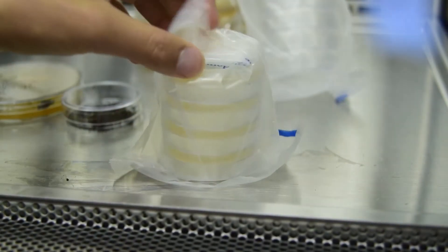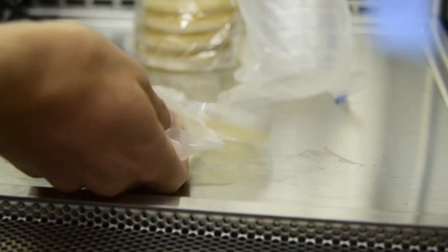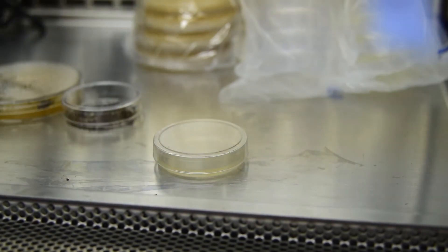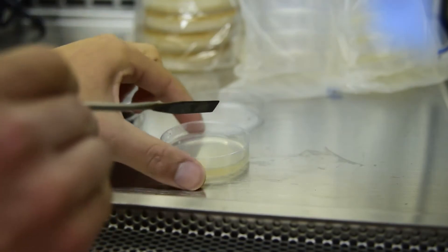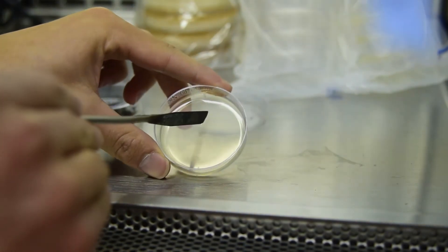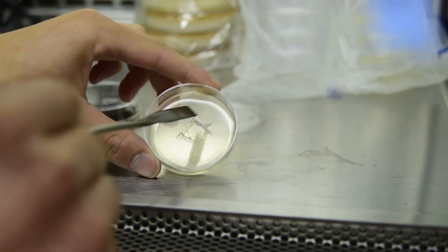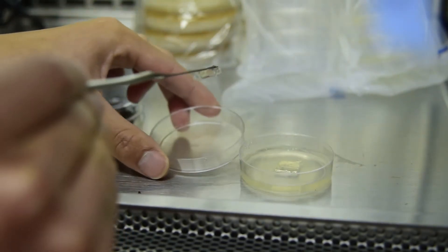Lastly, retrieve a 60mm nutrient plate to make a cutlet. Cut the square out with a sterilized spatula, then place that square on the lid.